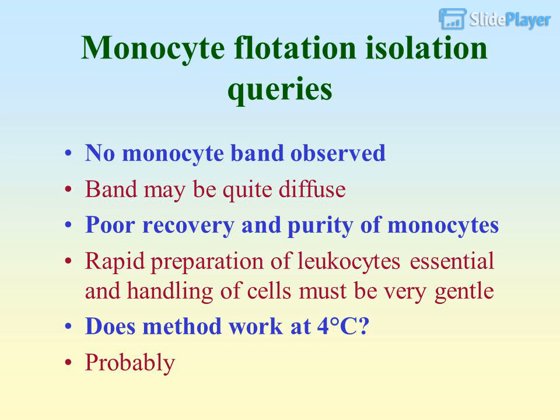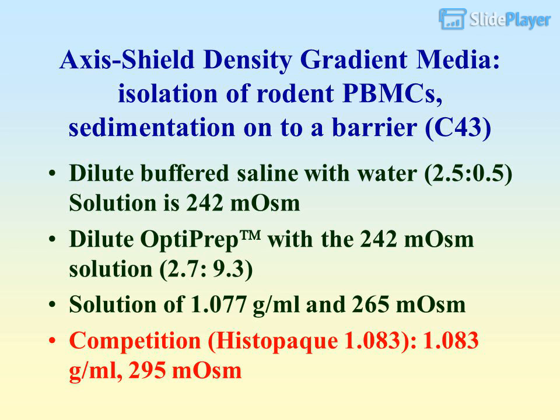Axis-Shield density gradient media, isolation of rodent PBMCs, sedimentation onto a barrier, C43.